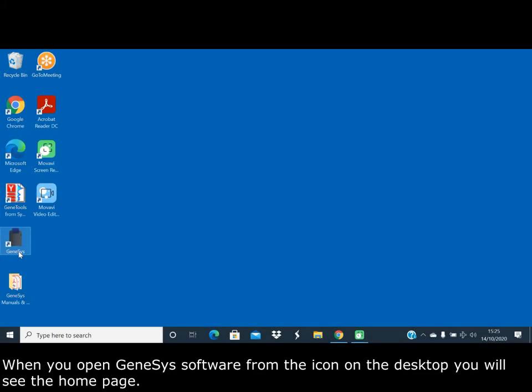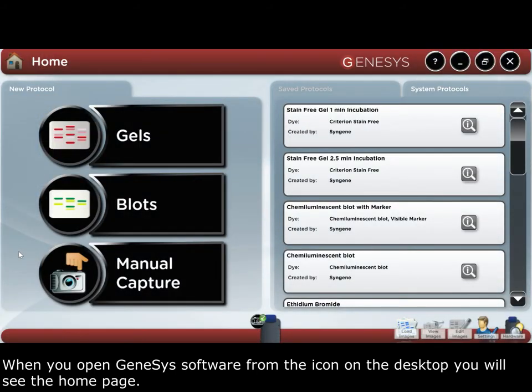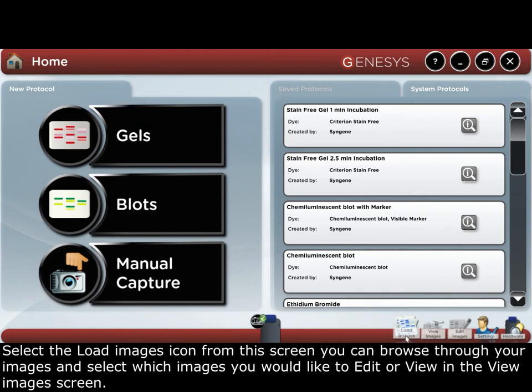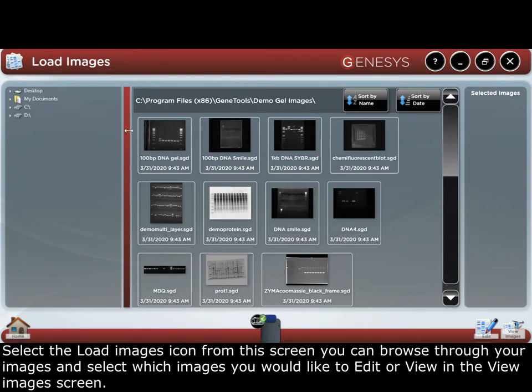When you open Genesis software from the icon on the desktop, you will see the home page. Select the load images icon. From this screen you can browse through your images and select which images you would like to edit or view.